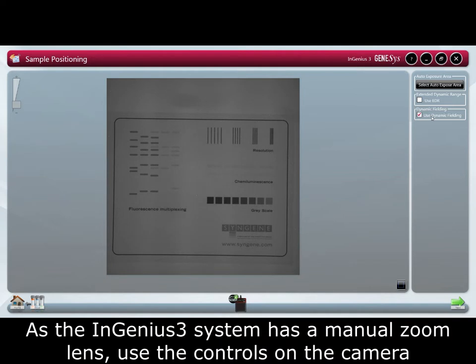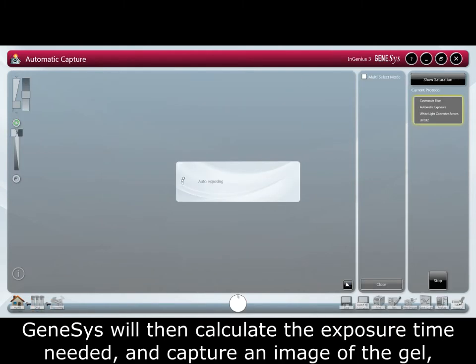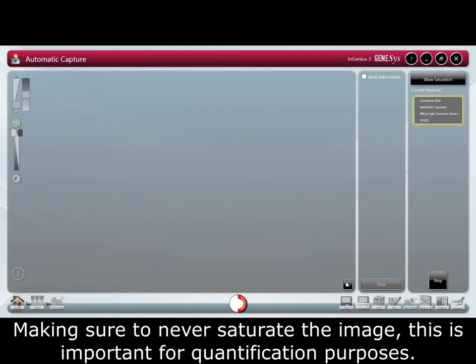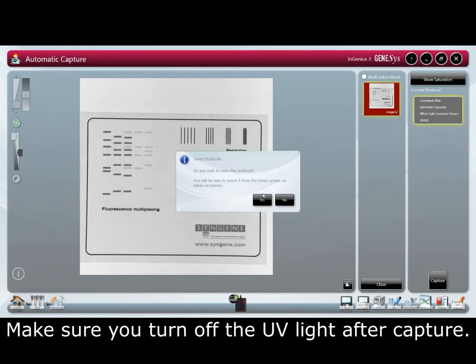As the InGenius 3 system has a manual zoom lens, use the controls on the camera to adjust the iris, focus, and the zoom. Genesys will then calculate the exposure time needed and capture an image of the gel, making sure to never saturate the image. This is important for quantification purposes. Make sure you turn off the UV light after capture.